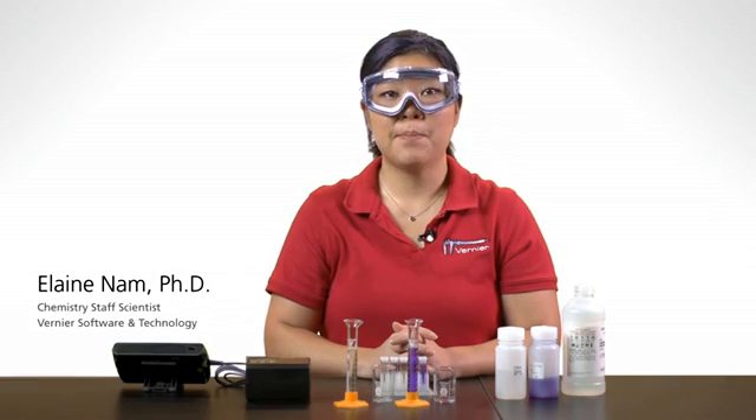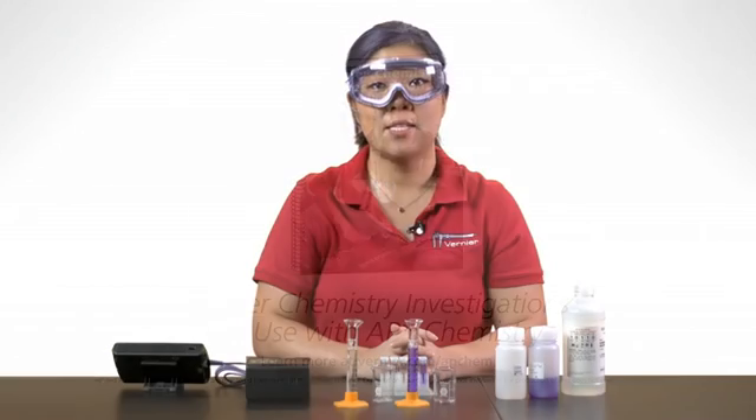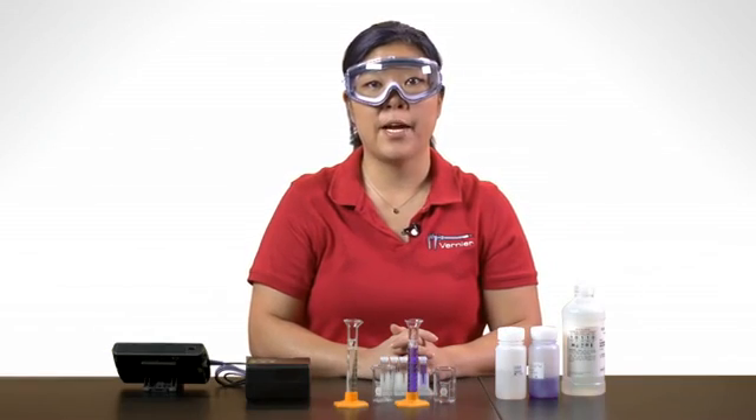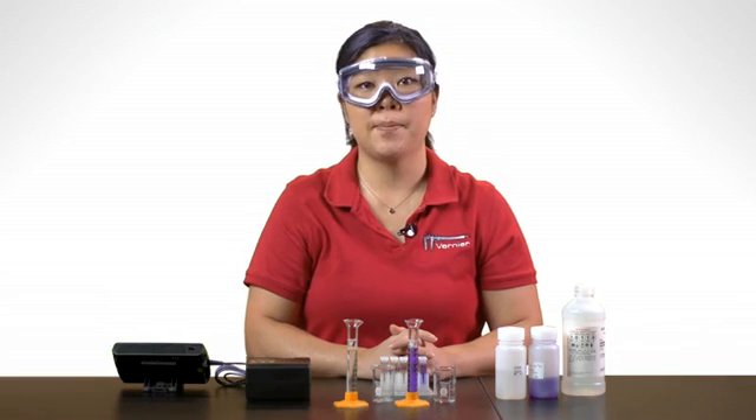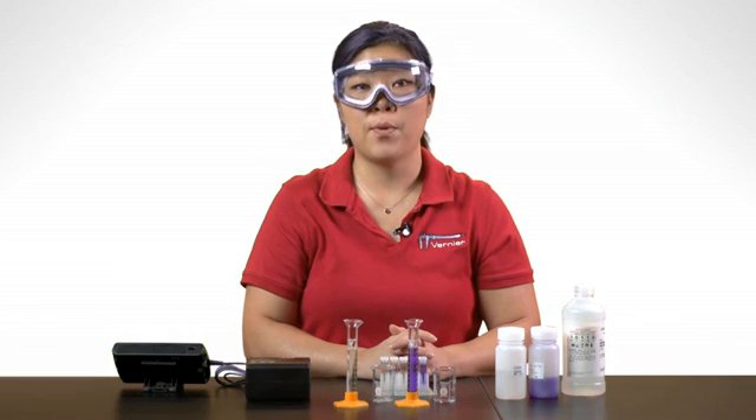This video will present tech tips for Lab 11 from the Vernier Chemistry Investigations for Use with AP Chemistry Lab Book, using the colorimeter. In this kinetics experiment, you'll be exploring the reaction between solutions of crystal violet and sodium hydroxide. One of the goals will be to write the rate law for the reaction.